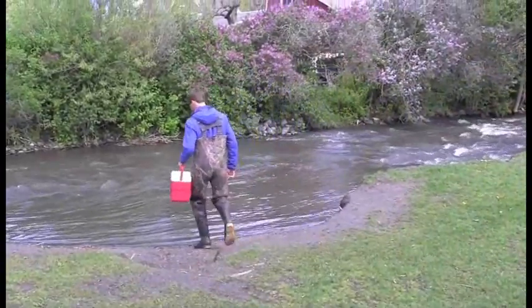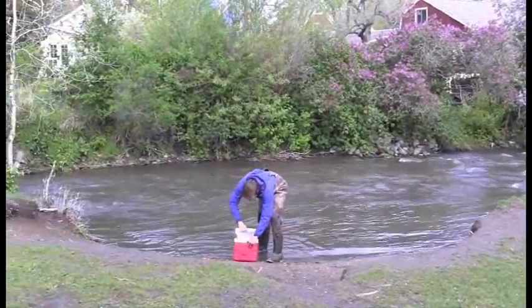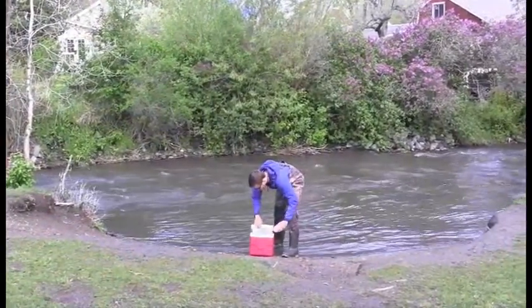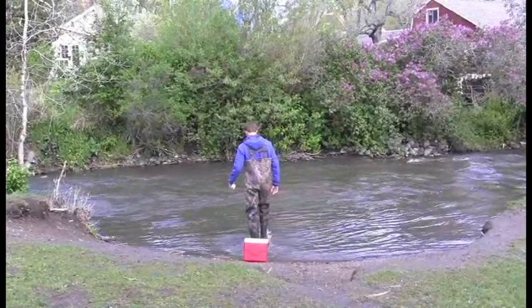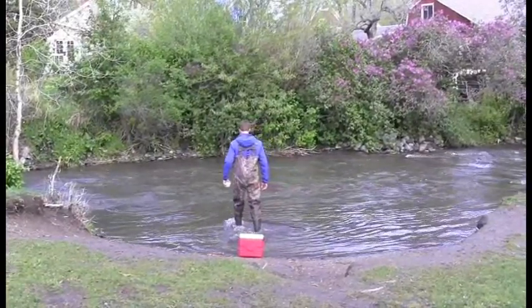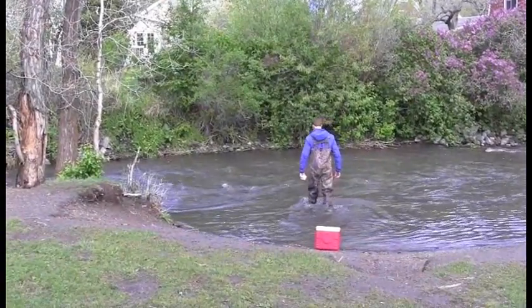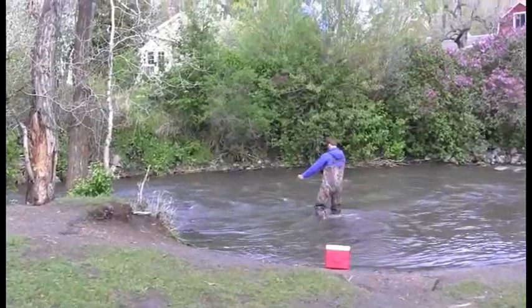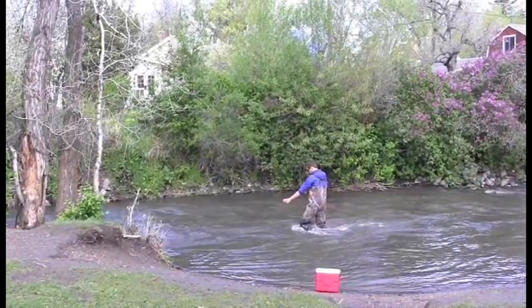Now that you are ready to fill the bottles, find a well-mixed portion of the stream to collect your water from. If the water is high, make sure to only enter up to a level you feel safe. If you do not feel safe entering the stream, then it is acceptable to collect a sample from the stream bank. It is also acceptable to collect a sample from the stream bank if stream flow is low and the substrate is soft and easily disturbed.